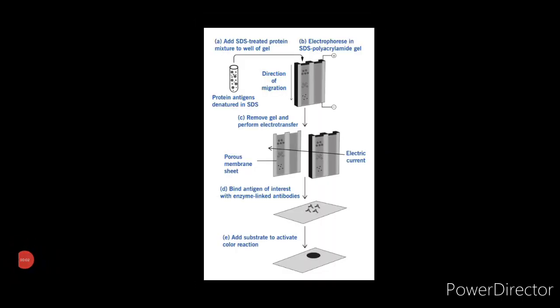Western blottings are immunoassays in which the antigens are immobilized on sheets of synthetic filter membranes, and these firmly adhering antigens on the membranes are referred to as immunoblots. Western blotting involves transfer of electrophoretically separated proteins of the test sample from the gel to a solid support such as nitrocellulose membrane and subsequently probing the blots with specific antibodies.